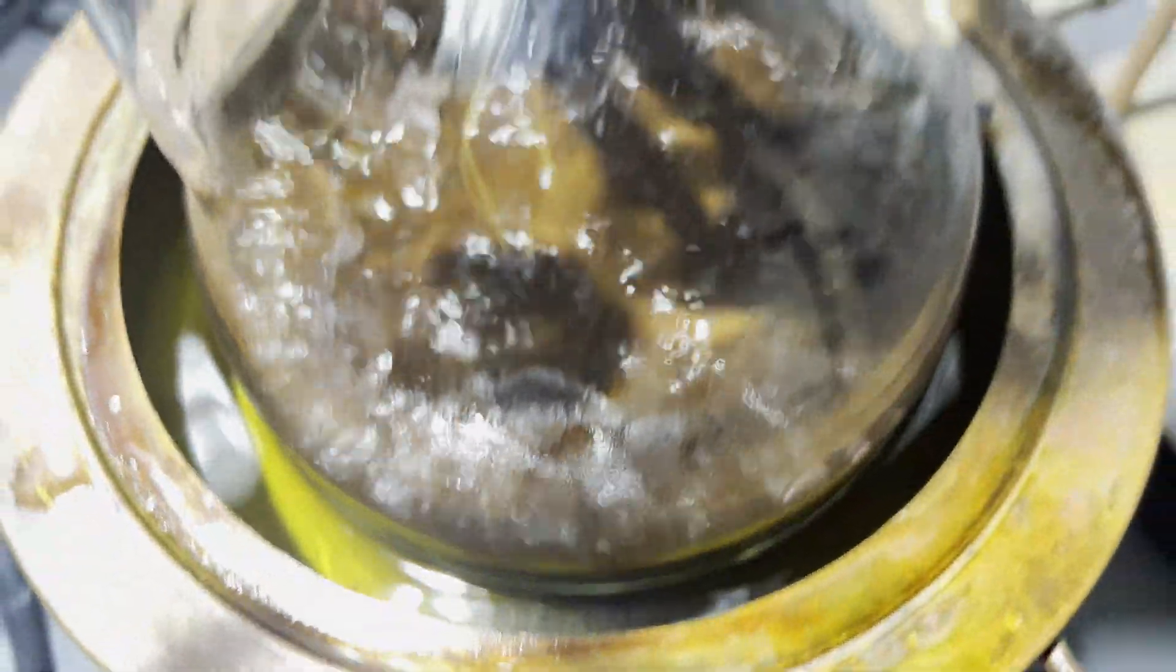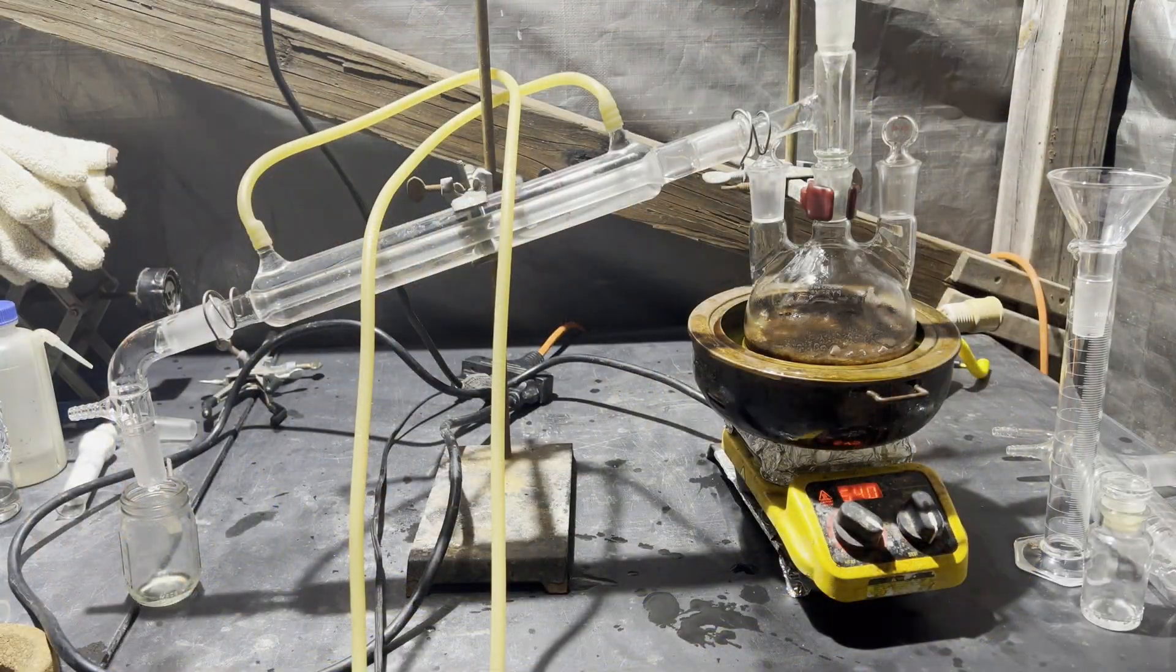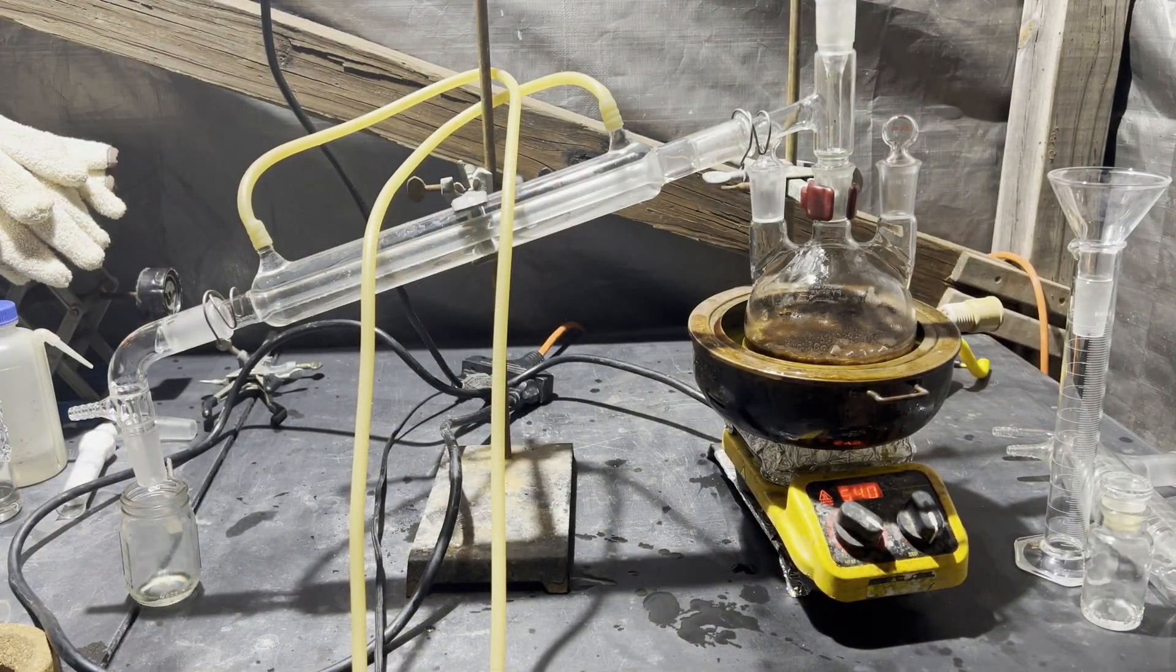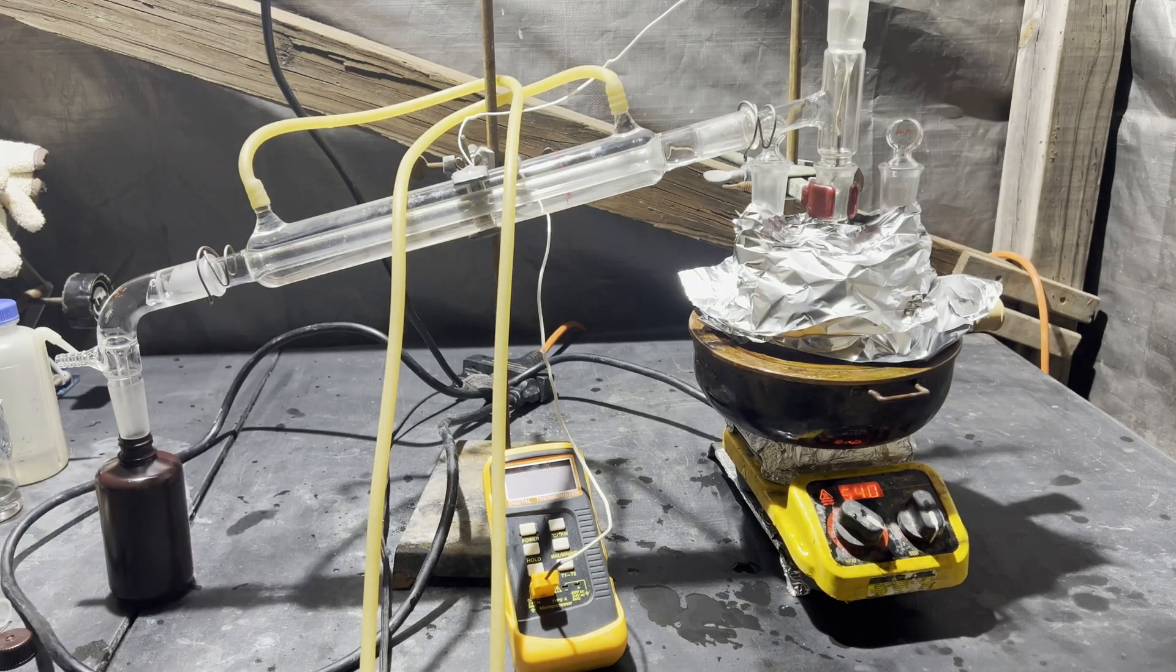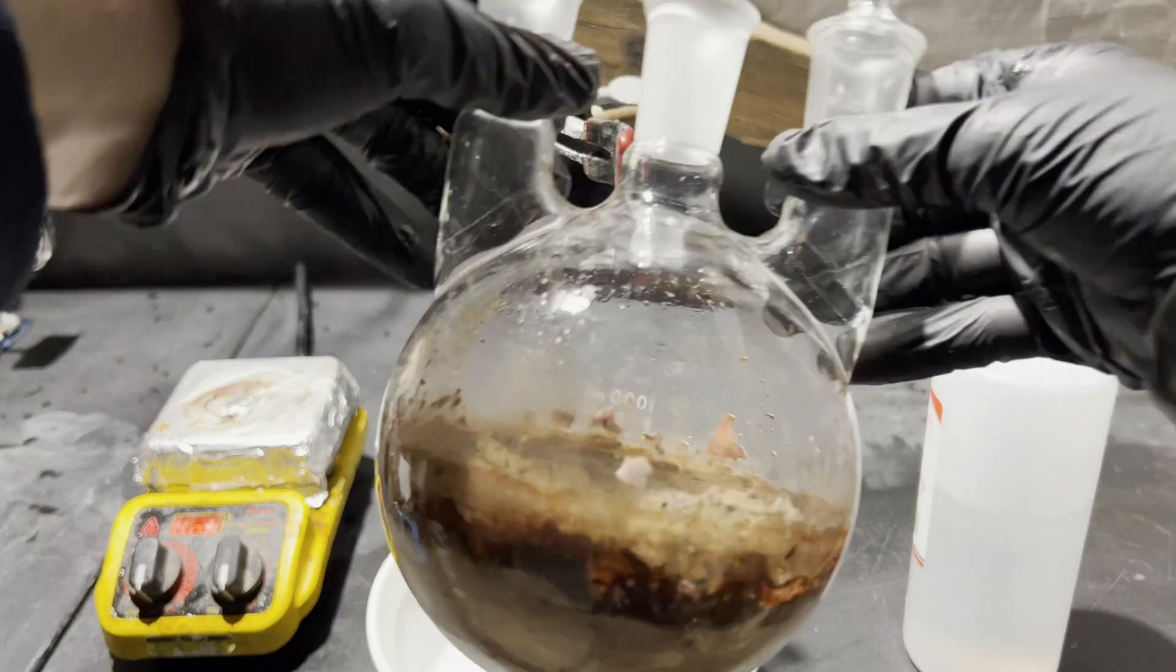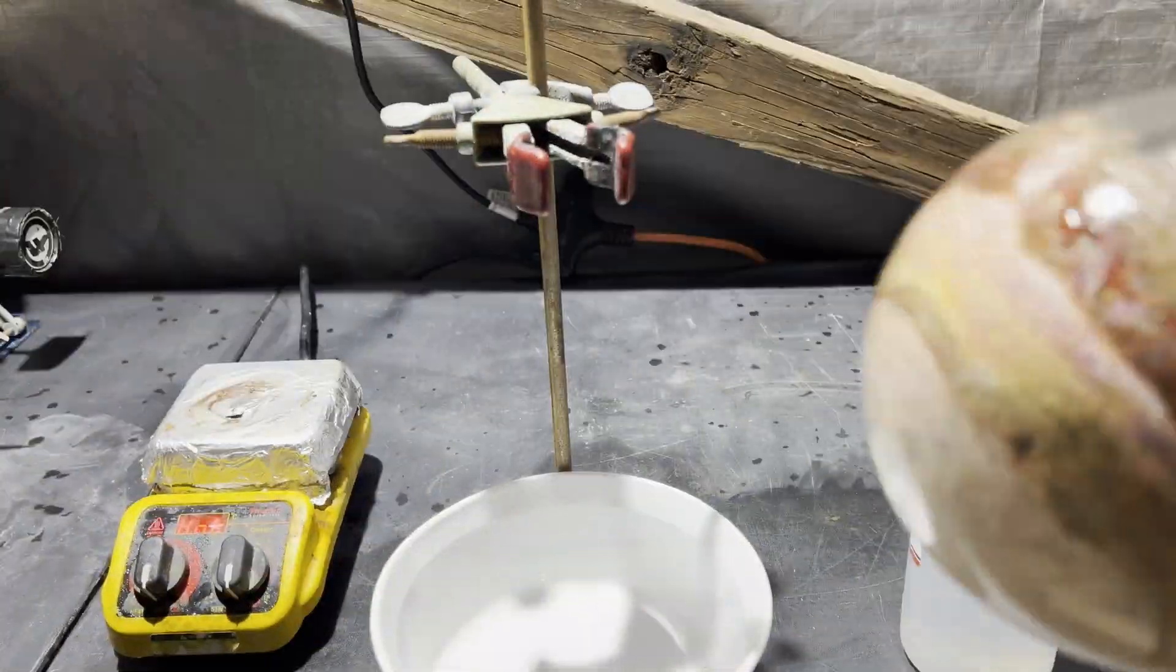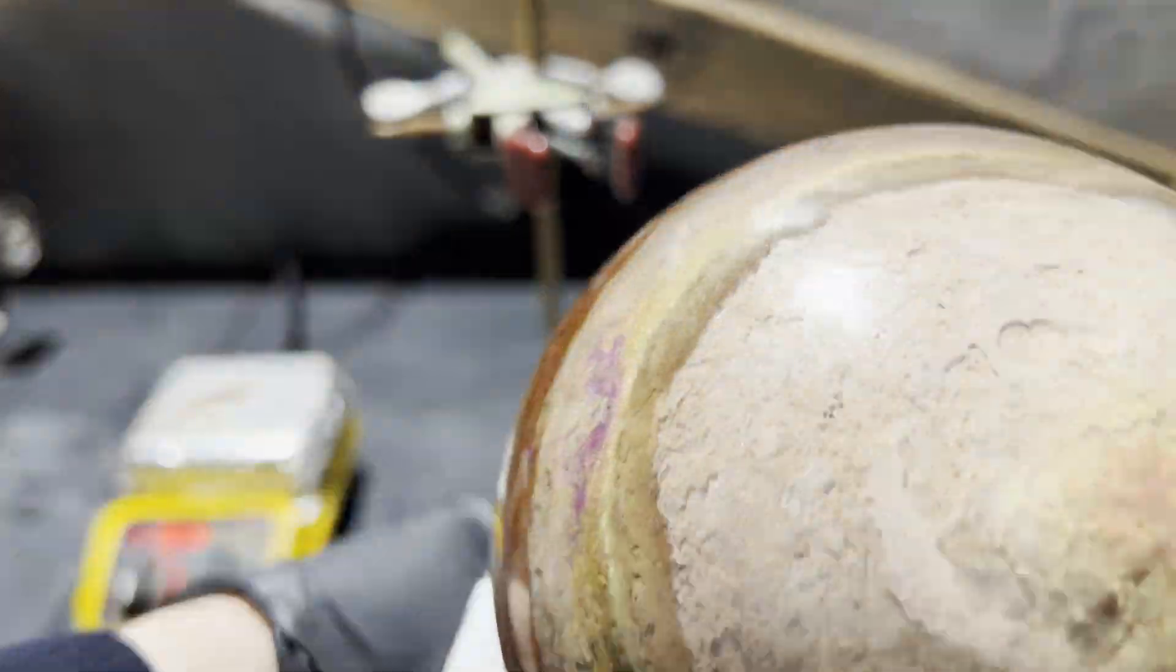Once the 24 hours was up, I swapped the reflux condenser to a simple distillation apparatus and distilled off as much ethanol as would come over. Using a heating mantle for this step would overheat the residue and char it as more ethanol is distilled. Hence the oil bath. The residue looks kinda like Jupiter, which I think is pretty cool.